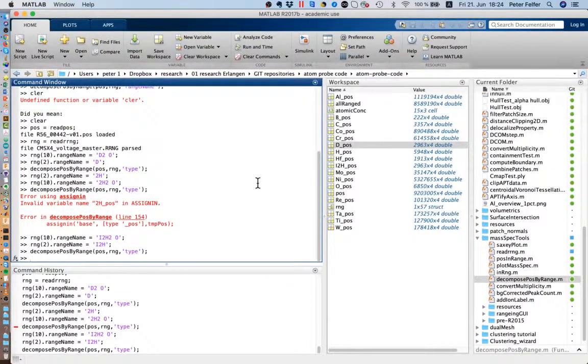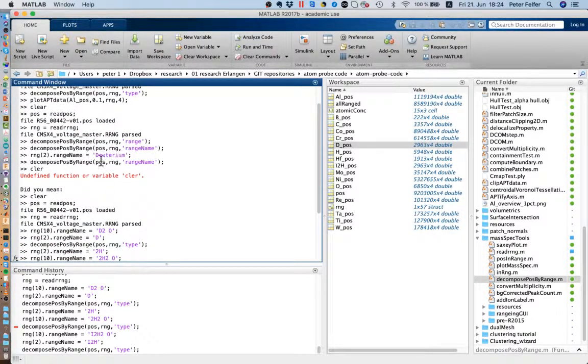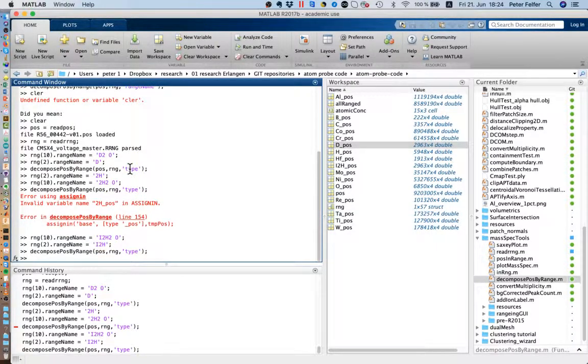Yeah, and this allows you to work with ranges that are just noise, or work with ranges that might be isotopic tracers, and you want to give them special names. I don't know, Johnny, Carly, whatever. And yeah, you can do that with the range names. There it's obviously a lot more trivial. Just call the range whatever you want. But you can also do it with mixed ions if you do the whole thing with an atomic decomposition, or in this case called type decomposition.